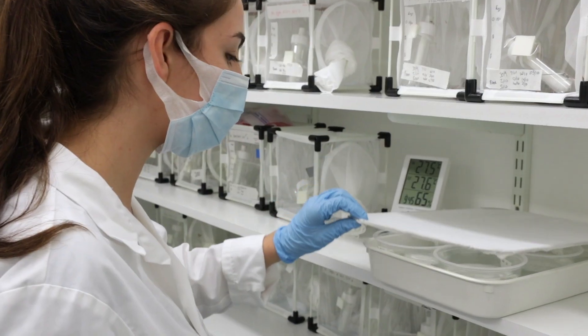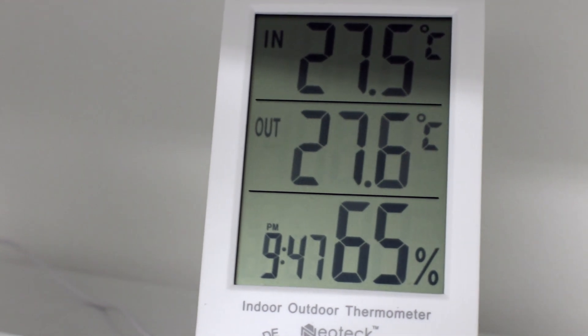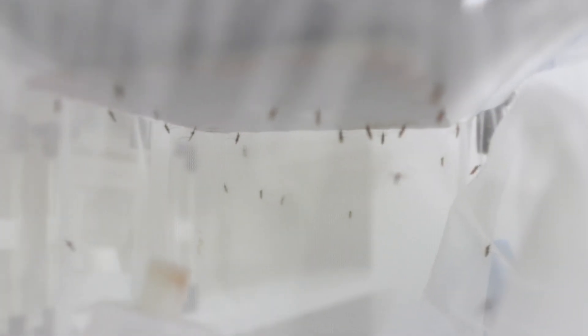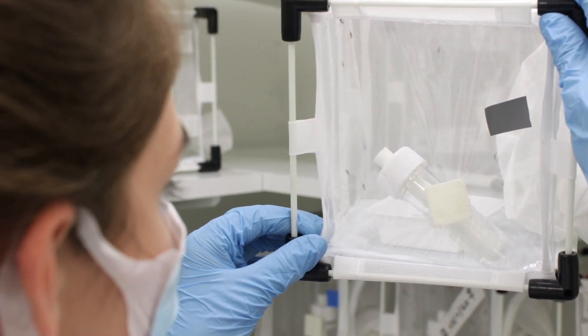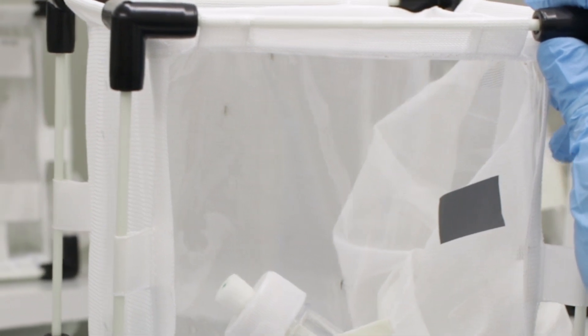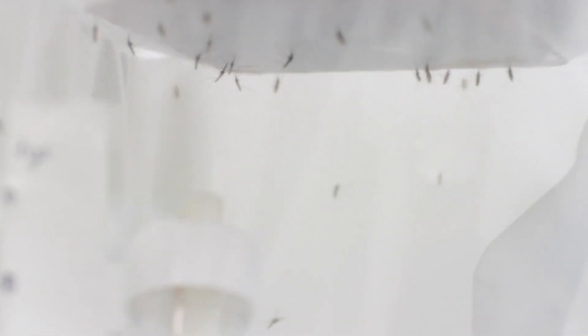We want our mosquitoes to live a long time, enabling us to rear them through every life stage from eggs to larvae to adults. While our strain of Aedes aegypti has already been developed and is successfully controlling populations elsewhere, our UK lab is busily applying this technology to other strains of mosquitoes and crop pests.